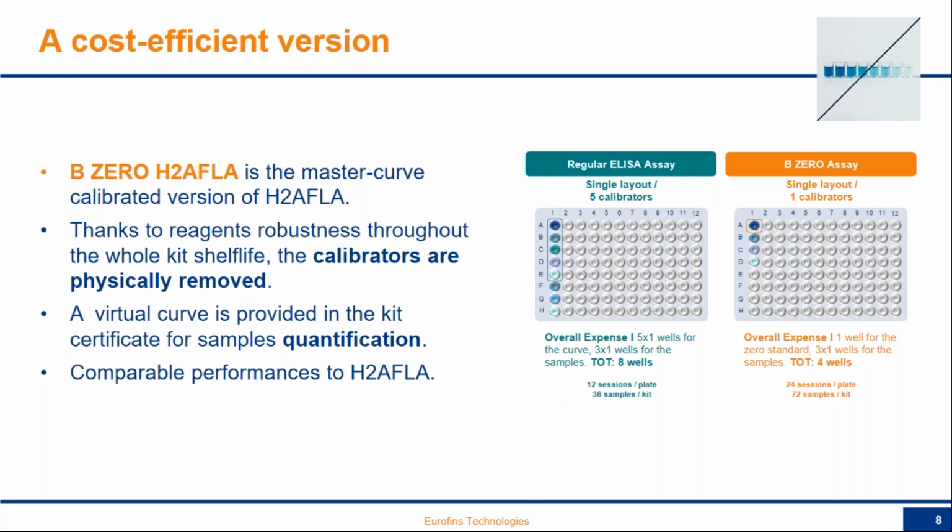You know that standard solutions are usually necessary in each ELISA analysis to guarantee quantitatively accurate results for samples. As the environment and human execution have a very important role in the signal relative intensities and therefore can affect results, calibrators are run together with samples to match any systematic data shift.